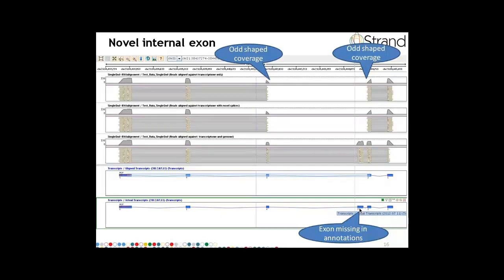Now, if reads are expressed from this particular transcript, then the reads which contain bases from the third exon, those reads will not align against the transcript model. They will only align when we align the reads against the genome also. And we can see that Avadis NGS handles those reads also fairly well, because we can see that there's a coverage out here which corresponds to the exon which is missing in the annotation.